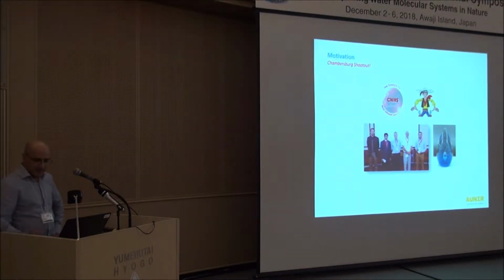Very nice. So we use the concept of covariance filters to solve that problem. And surprisingly, the second prize winner also used a similar approach. So there is definitely merit in investigating this sort of approaches in aquaphotomics.